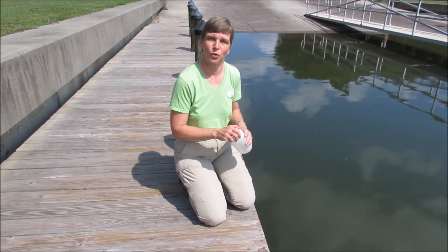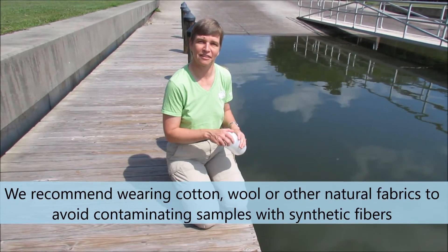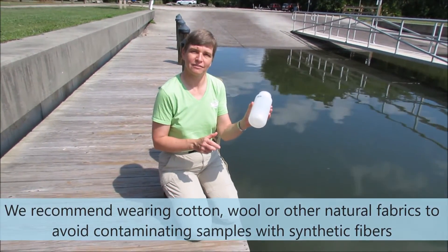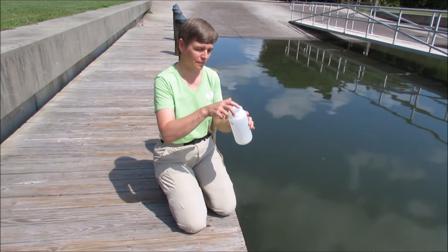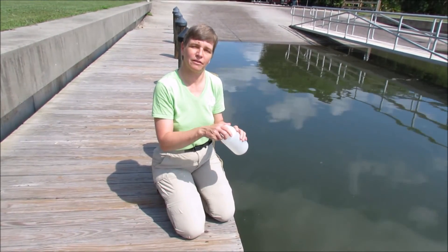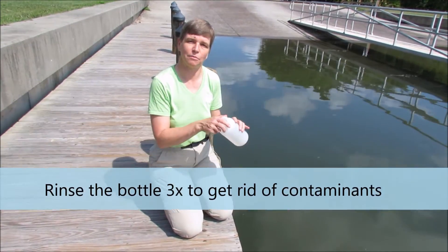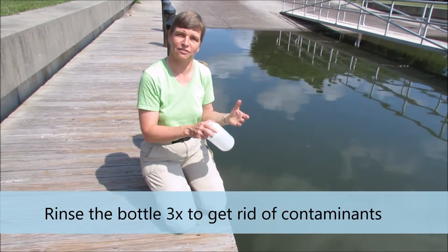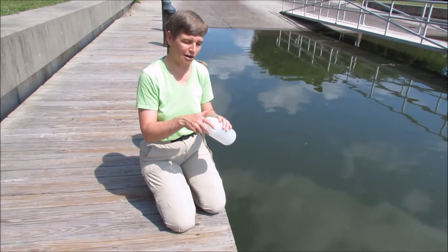Today we're going to show you how to collect a water sample for the Florida Microplastic Awareness Project. We're going to use our one liter Nalgene water collection bottle, and the first thing we're going to do is rinse the bottle three times. We want to do this just in case there's any contamination or any existing fibers inside the bottle.